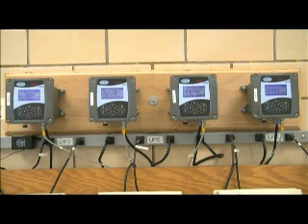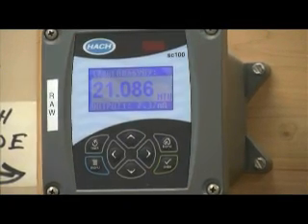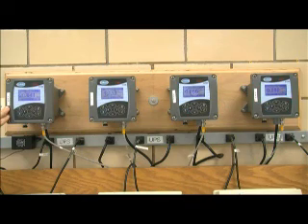Right now we're taking a look at the inline turbidimeters that we use to monitor the treatment process. You take a look here, this is the raw water turbidity, and turbidity is measured in NTU, as Dave mentioned, and that stands for nephelometric turbidity units, which really means the cloudiness or the particulate matter in the water.